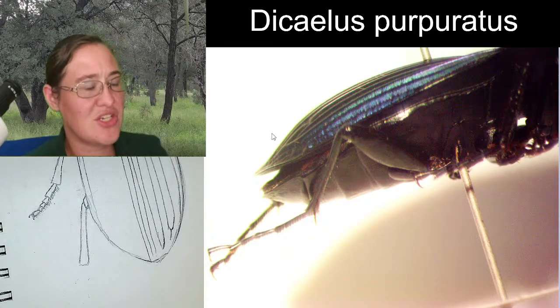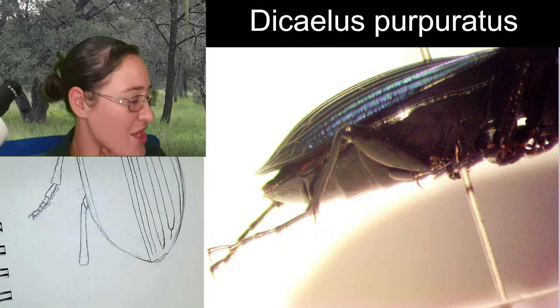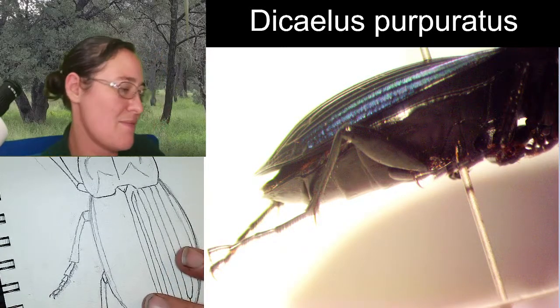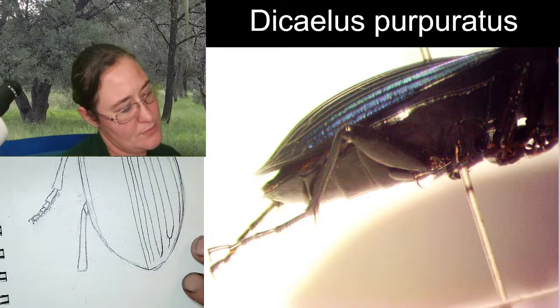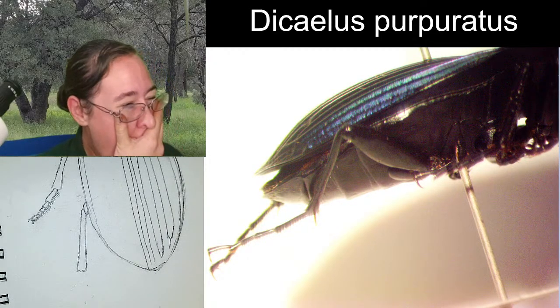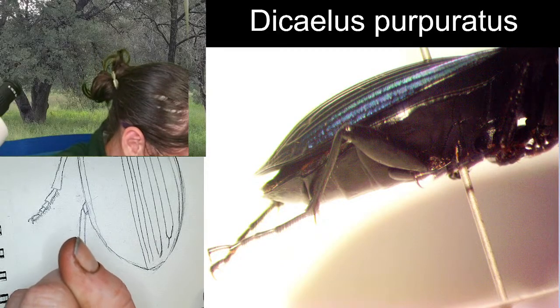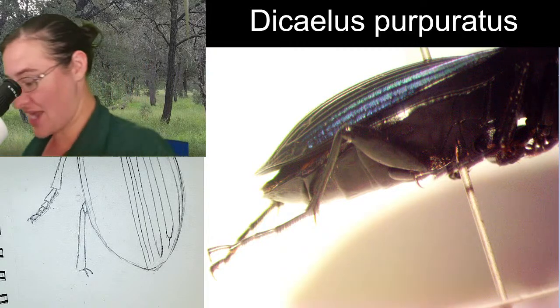So, essentially, the tibia and the femur are approximately the same length. Which means that my tibia, to make them more accurate, should be shorter. I need to start taking measurements before I draw. Alright, there's your two spines. And the others too. I can do that.